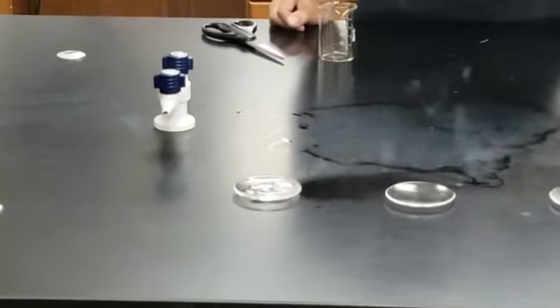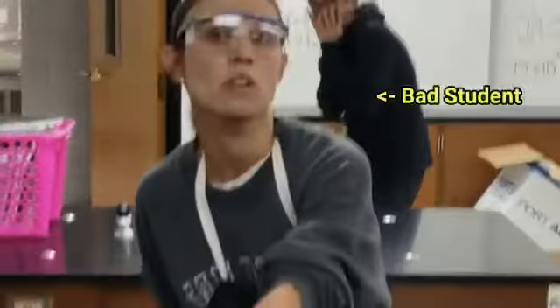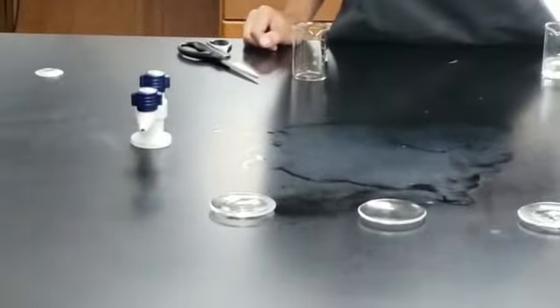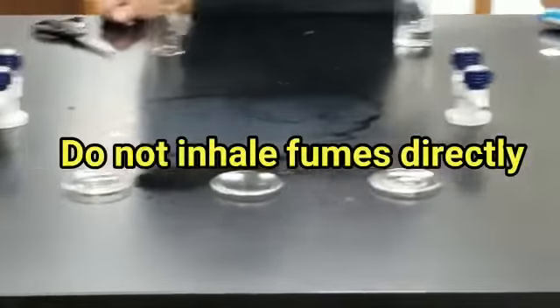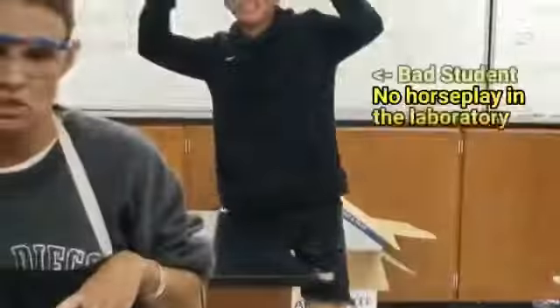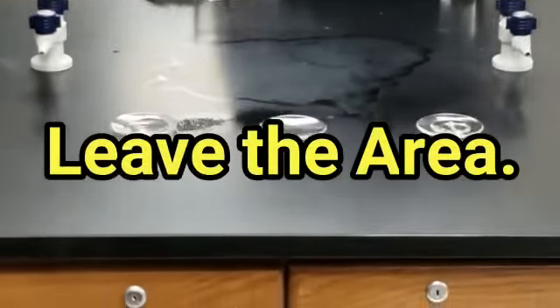That's why it's important to wear gloves when you work with corrosive liquids, because if it gets on your hand — well, I wouldn't want this to be on my hand. Also, there were fumes produced and it's not a great idea to inhale the fumes directly. If you're in a laboratory and fumes are produced and you ever get nauseous, make sure you leave the area and get some fresh air.